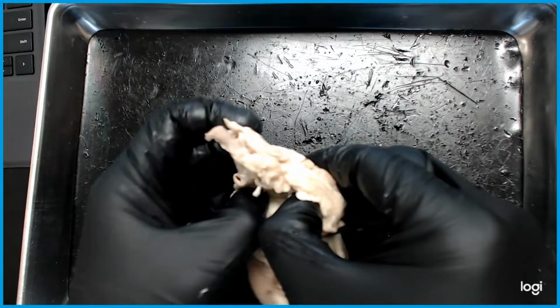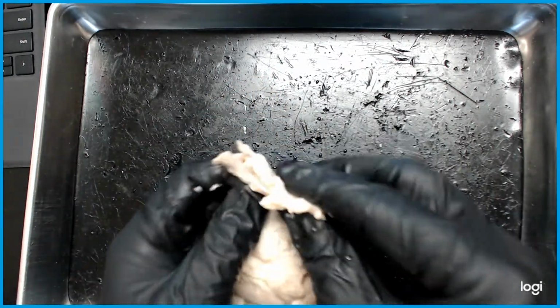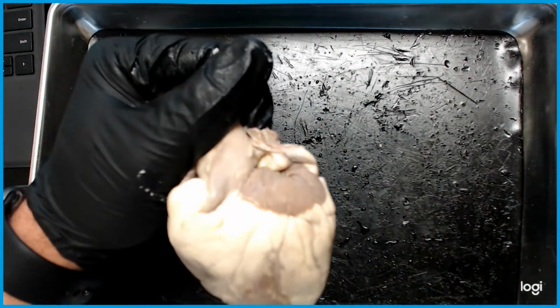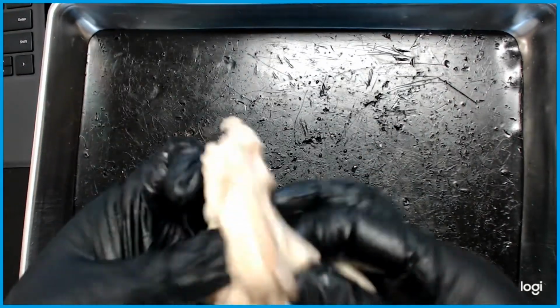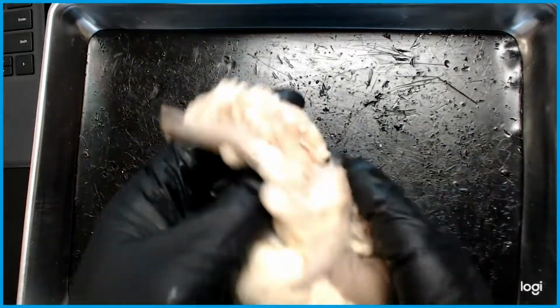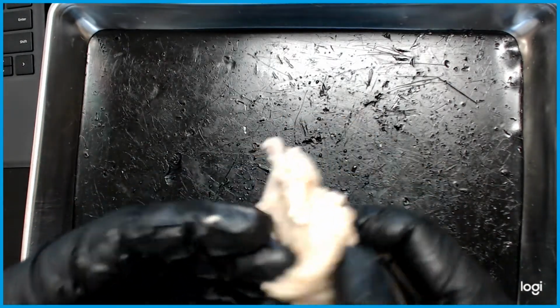As the next part, because not all hearts will be shipped the same, I'm going to remove some of the fat that we have on here, the excess fat that we don't need. We really want to focus on this section. But there are some blood vessels that if I'm able to clean them off, we'll be able to appreciate, and I can show them to you. You can see them on this video. You can tell this is a vessel here. And once I clean it up, we'll be able to determine where it's coming from, and I can give you an appropriate name.